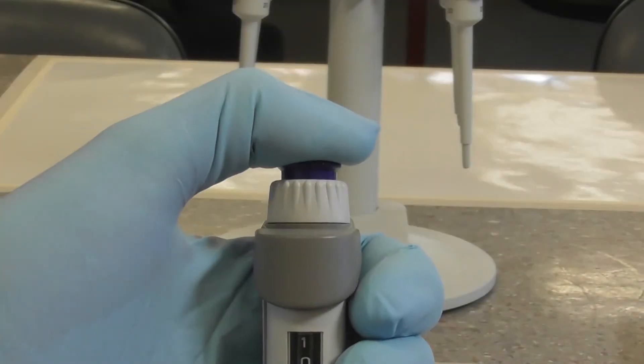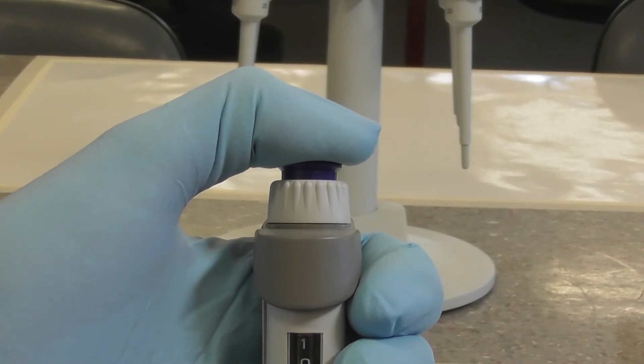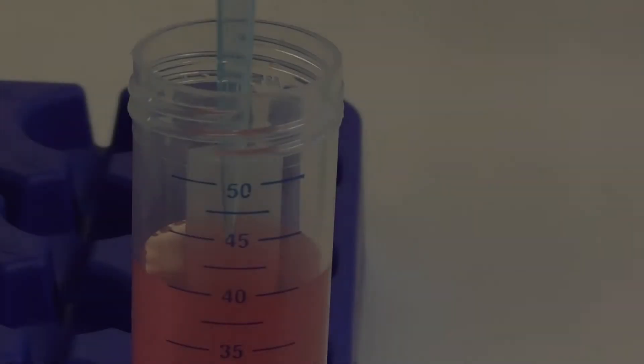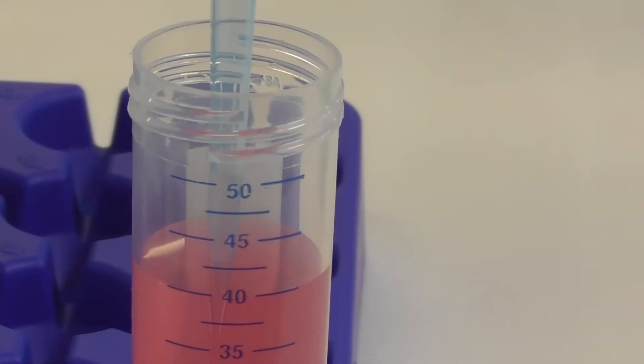You do this by first pressing the plunger down to the first stop or point of resistance. Then immersing the tip into the liquid by a few millimeters and then slowly releasing the plunger.